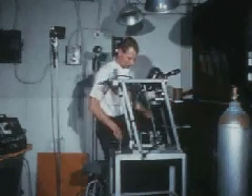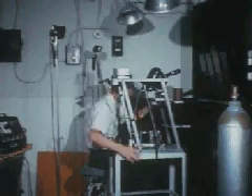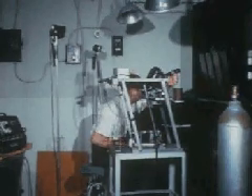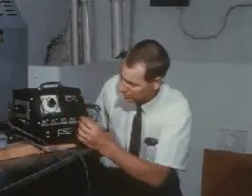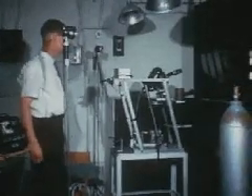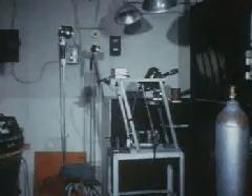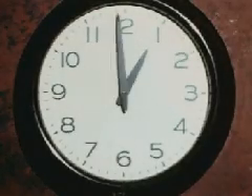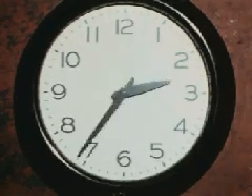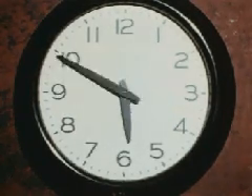For pictures at high magnification, the camera is mounted on an elevator which automatically moves the camera parallel to the glass window. It follows the tip of a root as it grows. The timer is set so that pictures are taken every 30 seconds for high magnification, and every three to five minutes for more distant shots at low magnification. Since different time intervals have been used in the various experiments, the passage of time will be indicated in each experiment by a tone at the end of each hour.